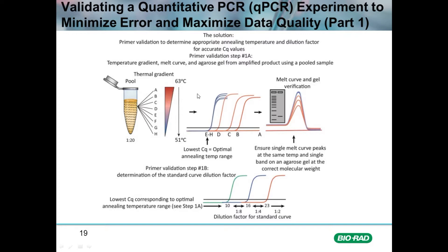The data from a thermal gradient looks like what we see here, where at the highest temperature there may be no amplification curve at all because the primers are not annealing at 63 degrees. As the temperature decreases going down the column from A to H, the curves come up at lower and lower cycles until they converge at the lowest cycle threshold — the most efficient annealing temperature range. In this case, the primers anneal at a lower temperature, perhaps between 51 and 55 degrees.